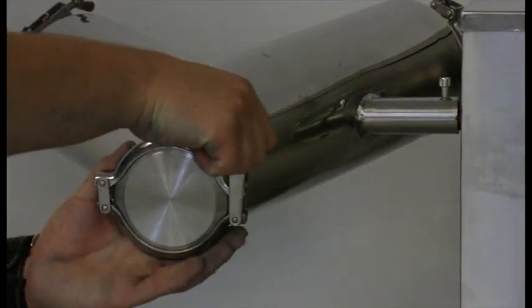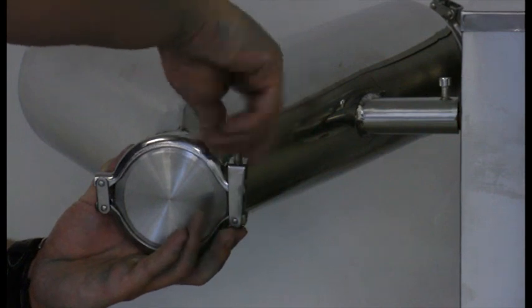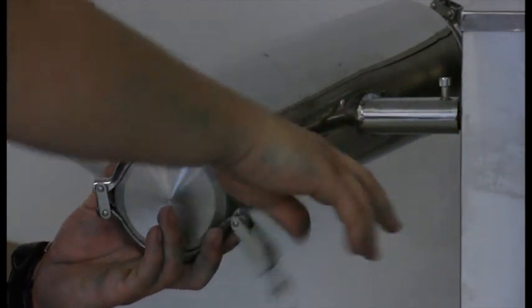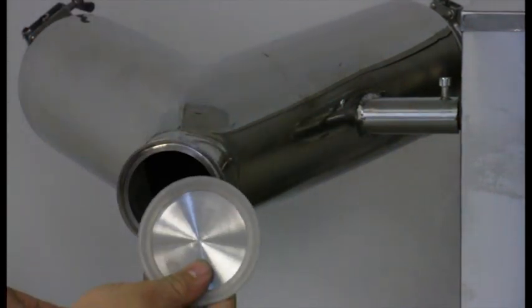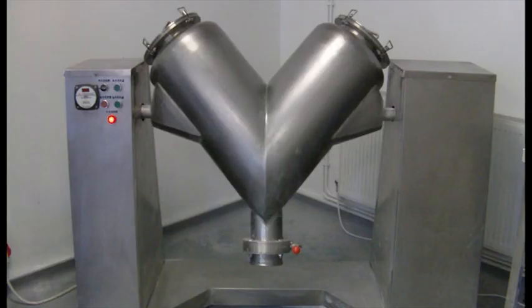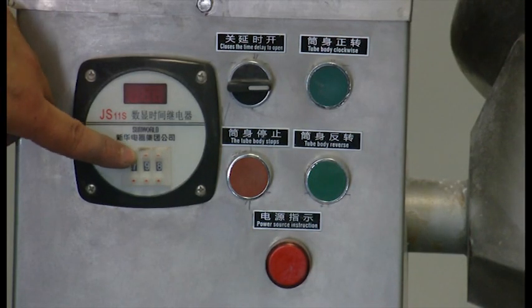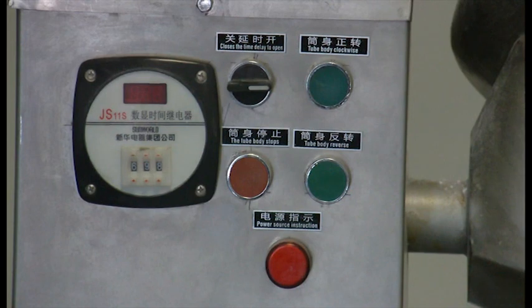The VH8 has a simple release system that includes rubber valves and a metal stopper. This means that a solid seal is always kept during mixing and the mixer can hold both wet and dry items. The VH100 has the same timing system as the VH8 that enables the operator to set the time.